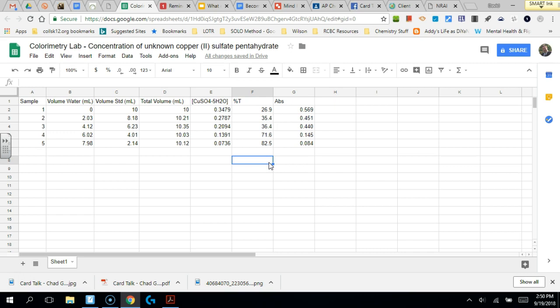The graphing can be the most interesting part of this whole lab because we have an unknown. With the unknown, we should get an idea of what the concentration is. Now, for the unknown, I'll put a column in here. The %T I got was 55.6.